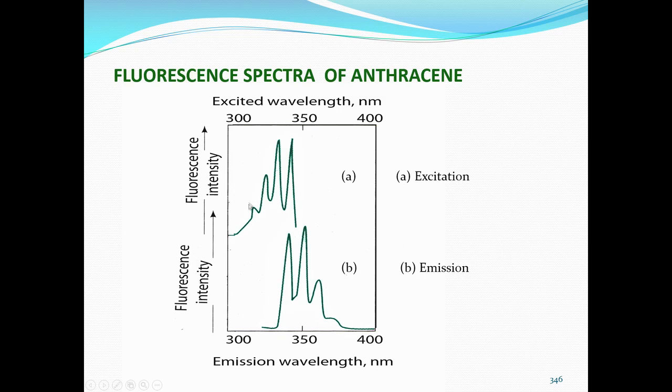So, A is the excitation wavelength. See here, this figure is essentially similar, as if it is pushed to the right almost. These two peaks correspond to these two, and these two have vanished here, and then there is one more appearing here. So, still you can say that both of them are approximately similar only. This proves the point what I was trying to teach you earlier.